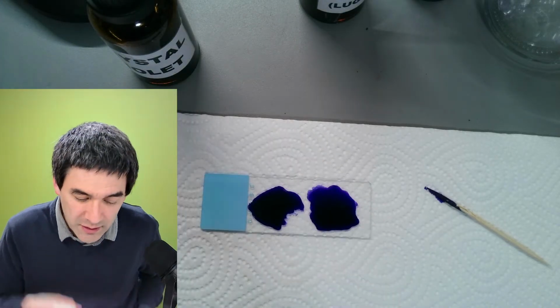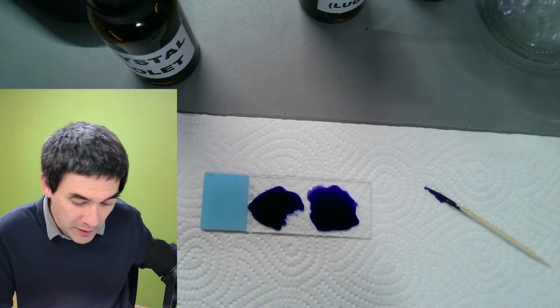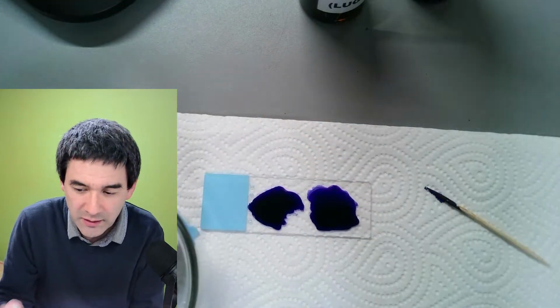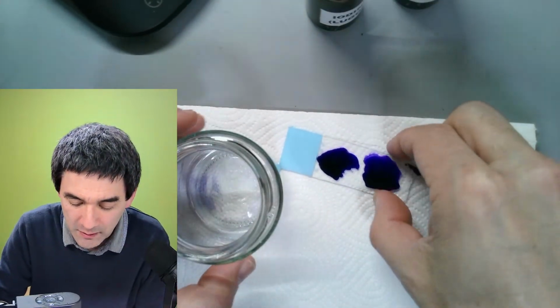Okay, so step one was the staining. Then what do I have to do? It says here, rinse with water. I'm going to show you now how I'm going to do that. So the crystal violet I can put away already, and I'm going to rinse it with water. And yeah, here on my table, I don't have enough space. It's of course much nicer to have a properly equipped lab. But look what I'm doing here.